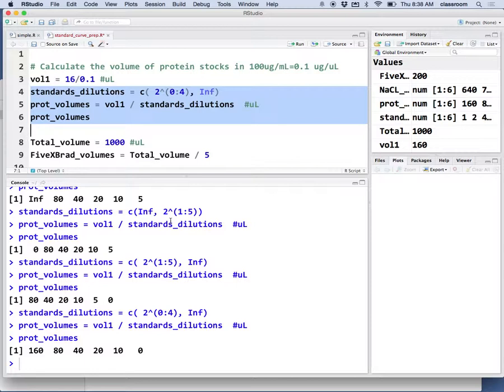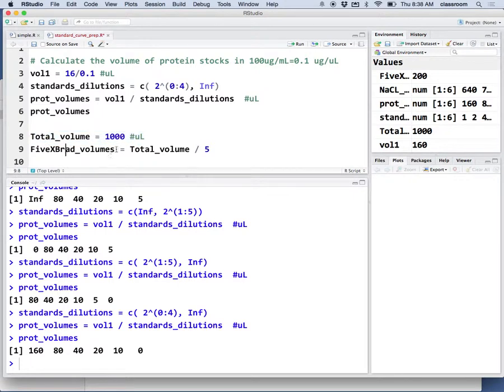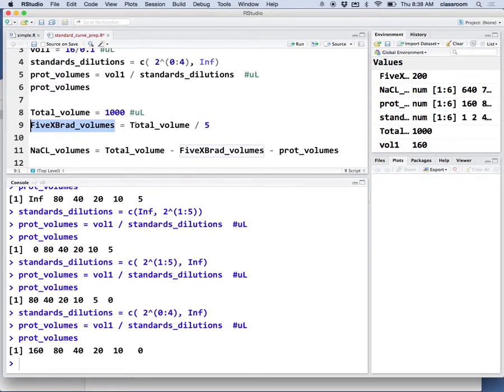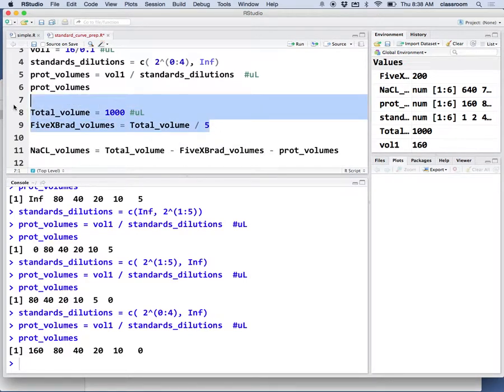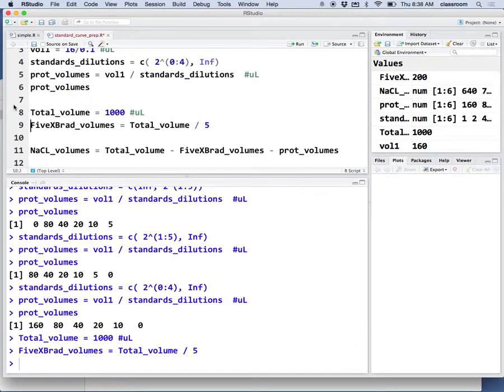Those are the protein volumes we need. The total volume is 1000, and the Bradford concentration is 5x, so the Bradford volume is the total volume divided by 5.